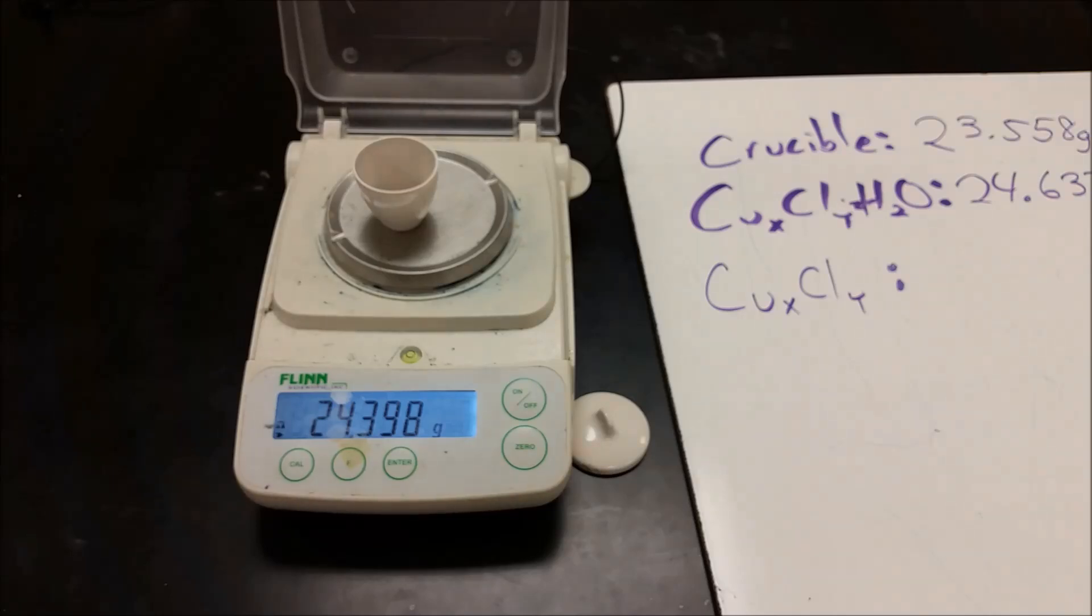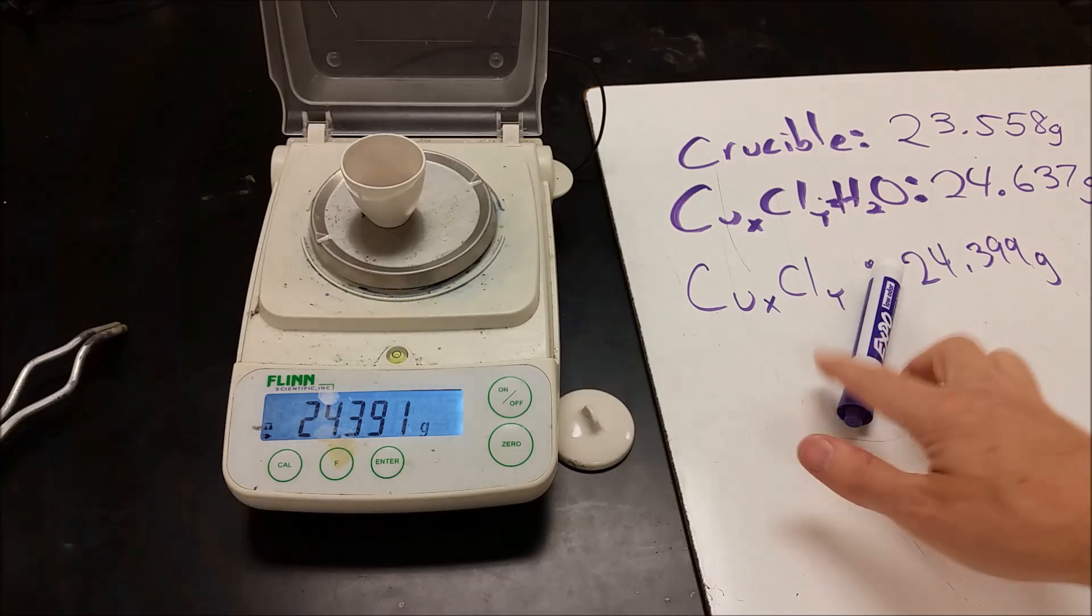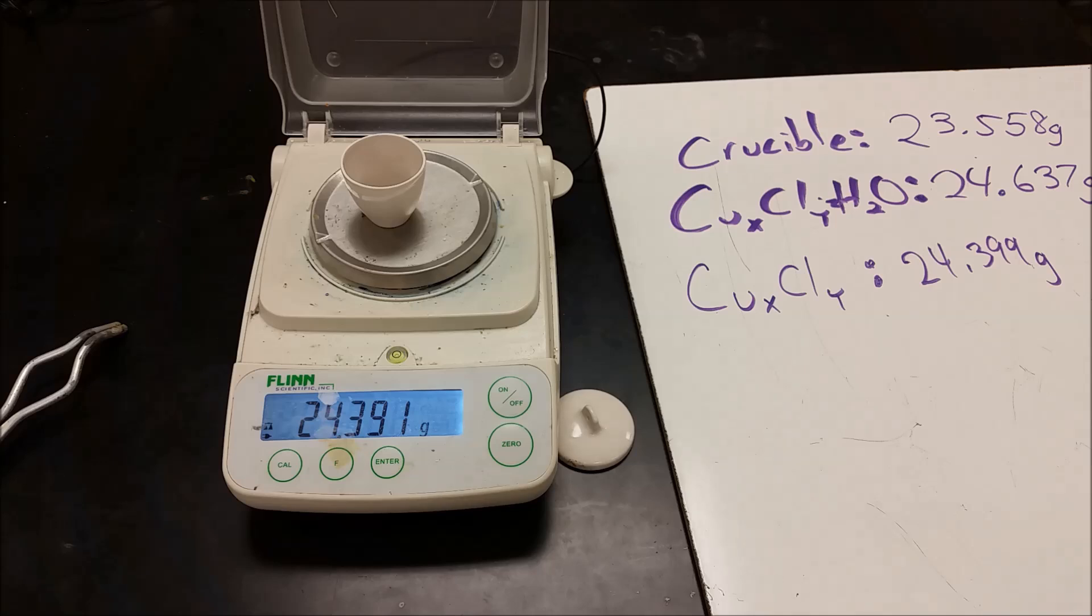So this is after our first heating. So we're going to go ahead and get that number down. Then we're going to go ahead and do it again. Make sure it's done. So we've done a little bit more heating. It's gone down very, very slightly. Keep in mind this is probably a little testing the accuracy of the thing. So we're going to go ahead and call that good there. Write that down as our final.